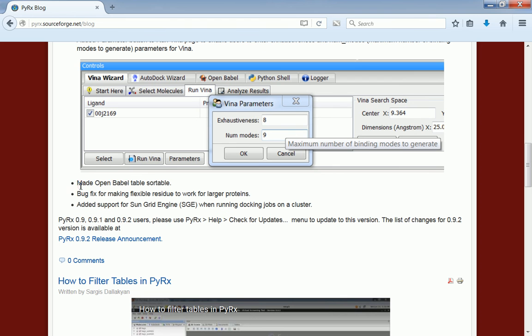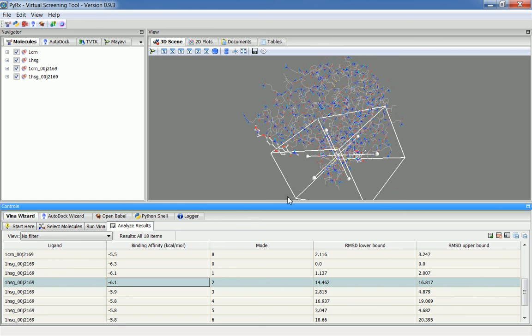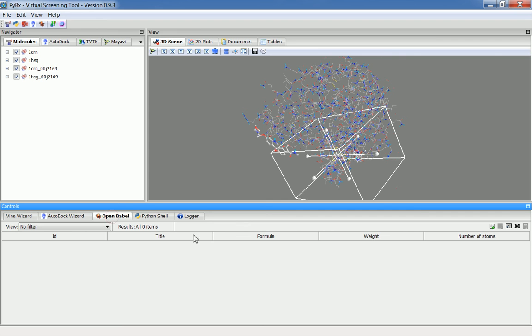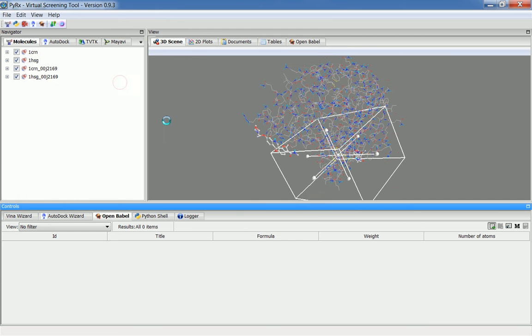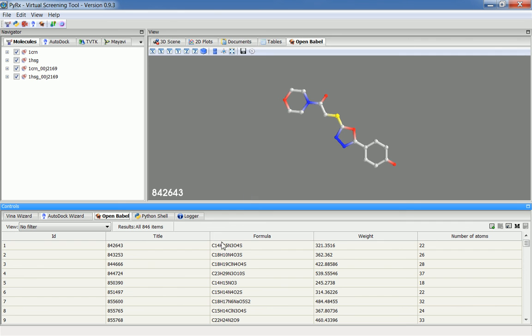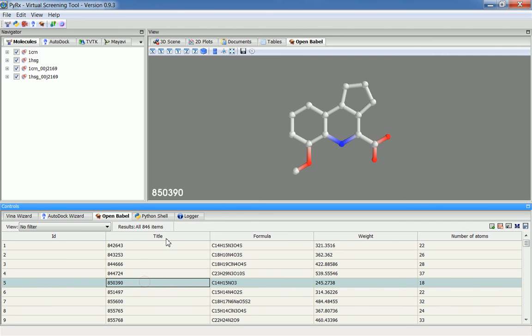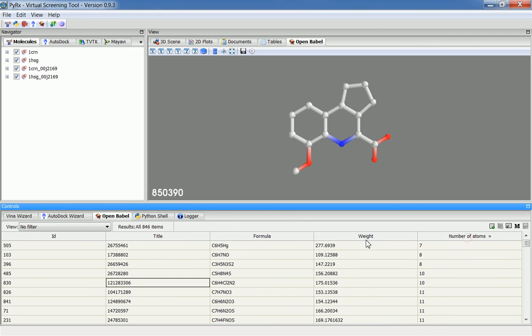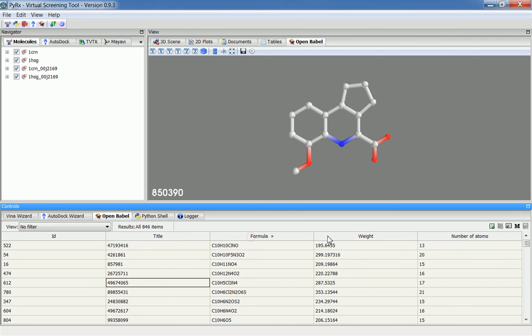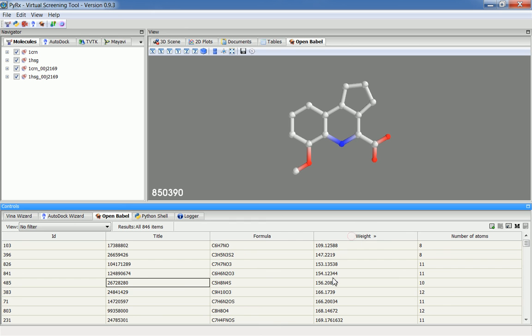This next new feature is an option to make OpenBabel tables sortable. When you work with OpenBabel, you upload one of the SDF from PubChem, and now you will be able to click on the heading and sort these compounds by molecular weight or number of atoms. This is useful if you are working with large number of molecules, and you want to easily sort this.